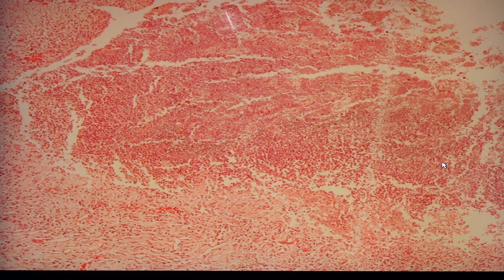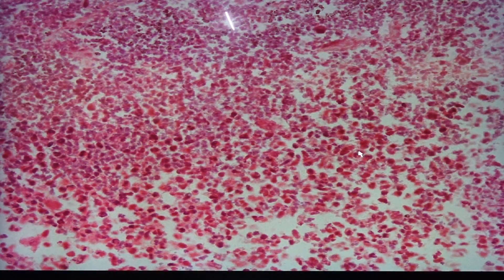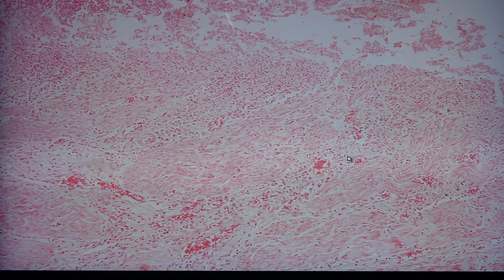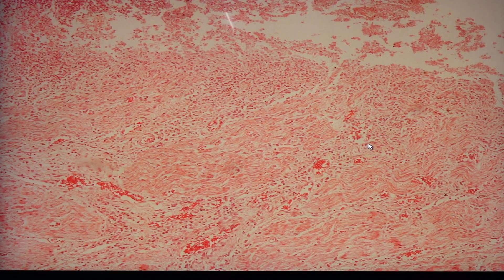Histologically we would see the presence of this ulcer containing necrotic debris, along with a lot of segmenters or neutrophils in the area. Underneath, we have the presence of granulation tissue, which is identified by vascular proliferation, the presence of mononuclear cells, fibroblasts.